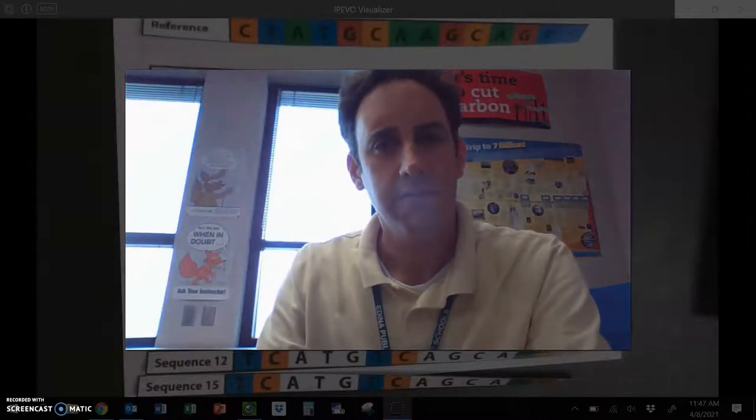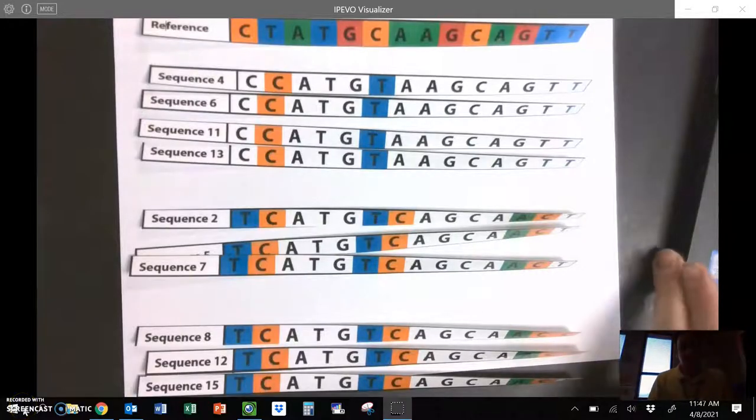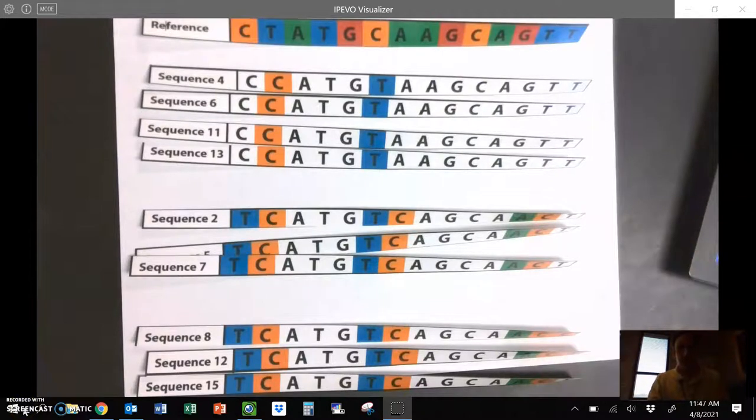Sanger here, and what I want to do today is a quick recap of how to reconstruct that phylogenetic tree from the Ebola DNA sequences. So, let's take a look at our sequences. The first part of this task was you were supposed to look at the DNA sequences and just kind of organize them and group them together.